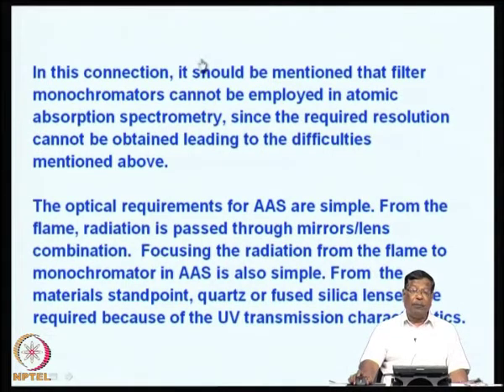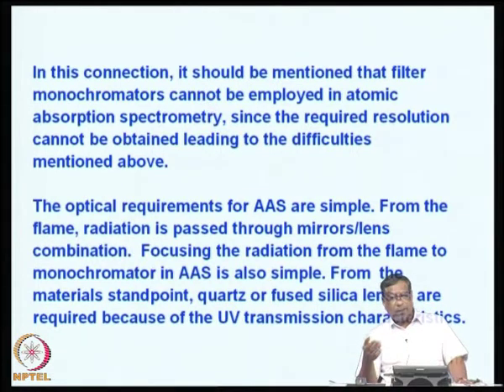Depends upon the model. So, when you are buying an instrument, you should be aware of the Littrow mounting advantages as well as Czerny-Turner mounting advantages.